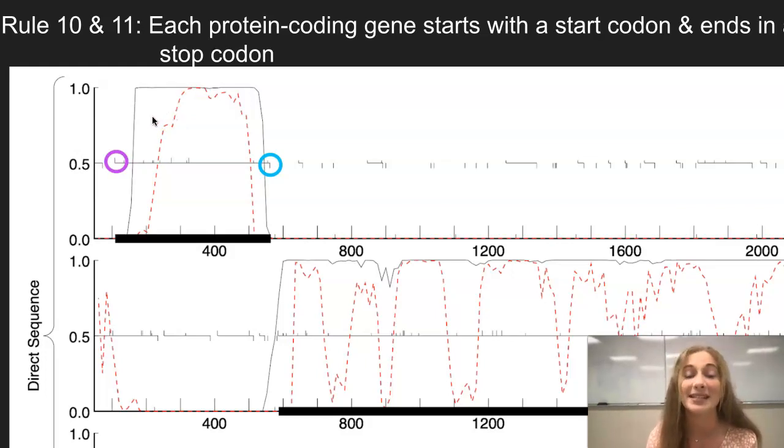So there might be databases that don't call the start TTG, but it actually might be the start in some situations. And then in this blue circle, this downtick signifies a stop codon, which will stop the coding of this gene.